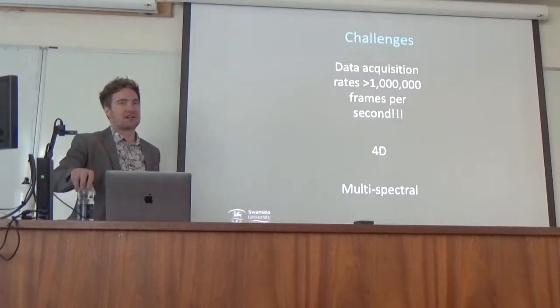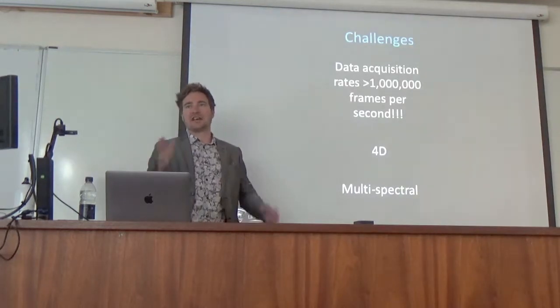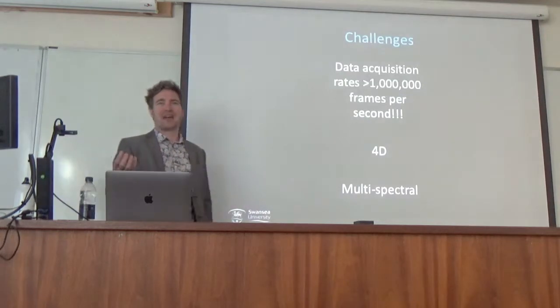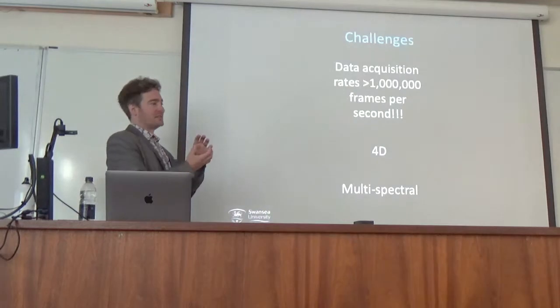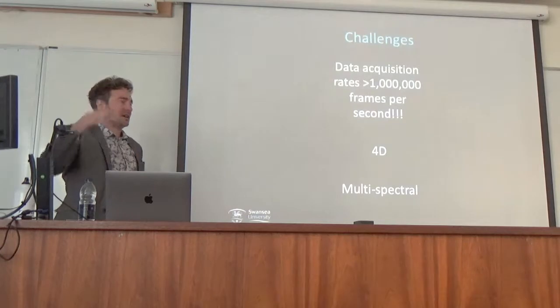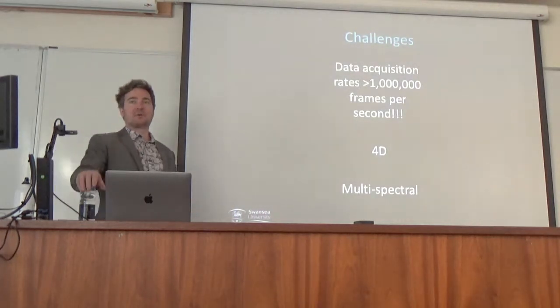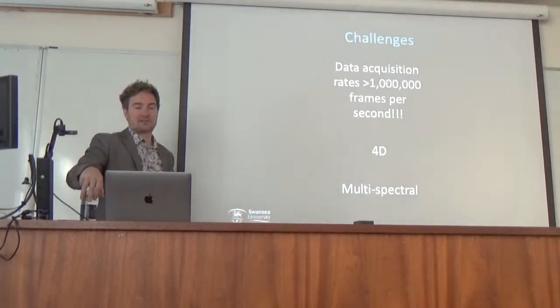So that means you're not just generating attenuation. You see the structure with X-ray imaging, the edges of things and the varying grayscales throughout. But multispectral means you might have chemical data overlaid with your structural data. And so for every single scan, or every single data specimen, you have an ever-growing volume of data to analyze, and correlating between the two data sets is a computing challenge. So yeah, those are some of the challenges that I see for us as an imaging and tomography field going forward.